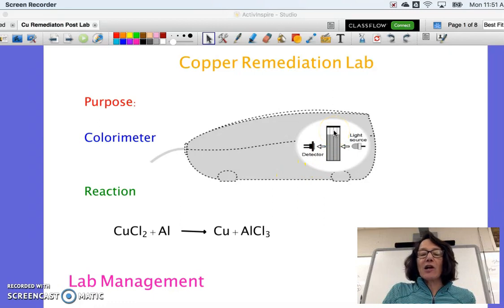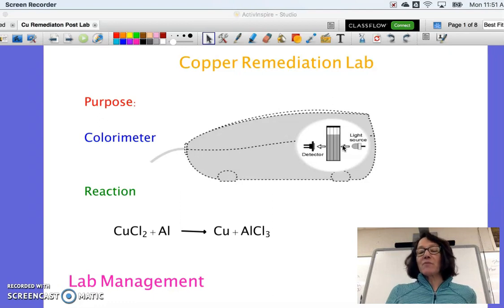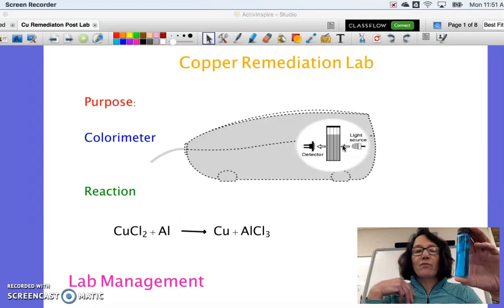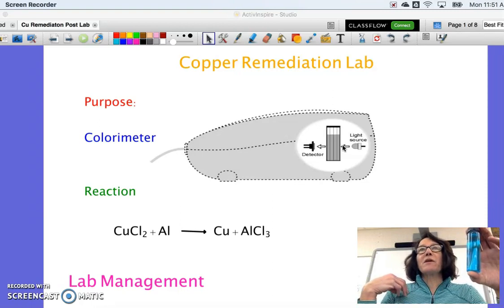So the way the colorimeter works, as you can see from this diagram, is that I'm going to put a little cuvette in here, and it's important that the cuvette is positioned correctly. There are ribbed sides and clear sides, and I want that light source to be able to travel through the clear sides. So I always hold it by the side with the ribbing or edging on it and wipe off those clear sides with a tissue or paper so that the light can pass through there very easily without being impeded at all. So the colorimeter is measuring the absorbance of that solution, and you can see that our original 50,000 ppm, or parts per million, solution is very dark in color. And so there's going to be a relationship between how dark or how concentrated that solution is and its absorbance.